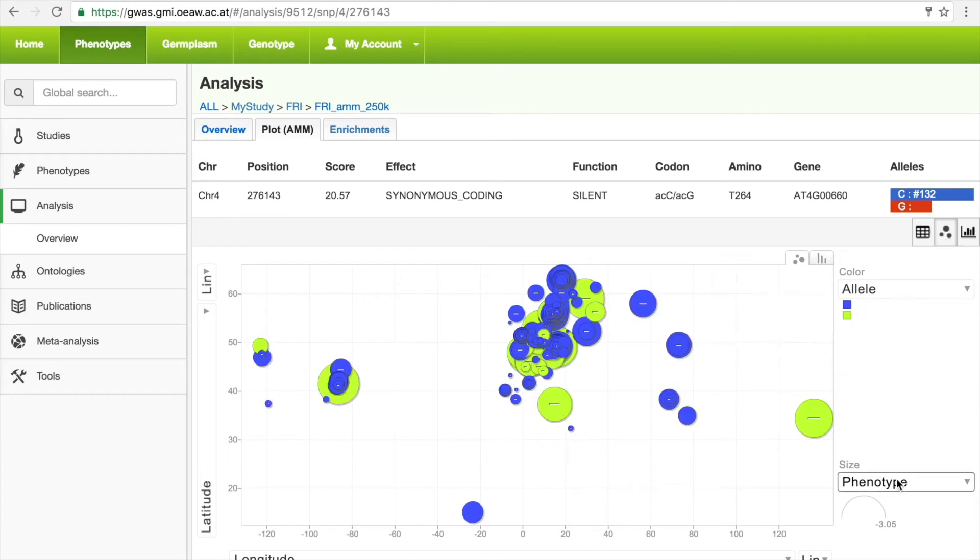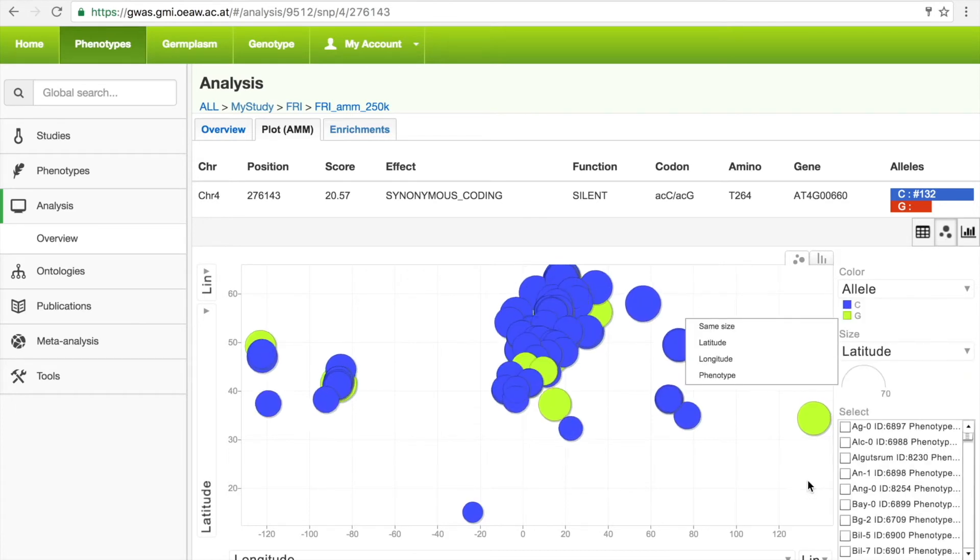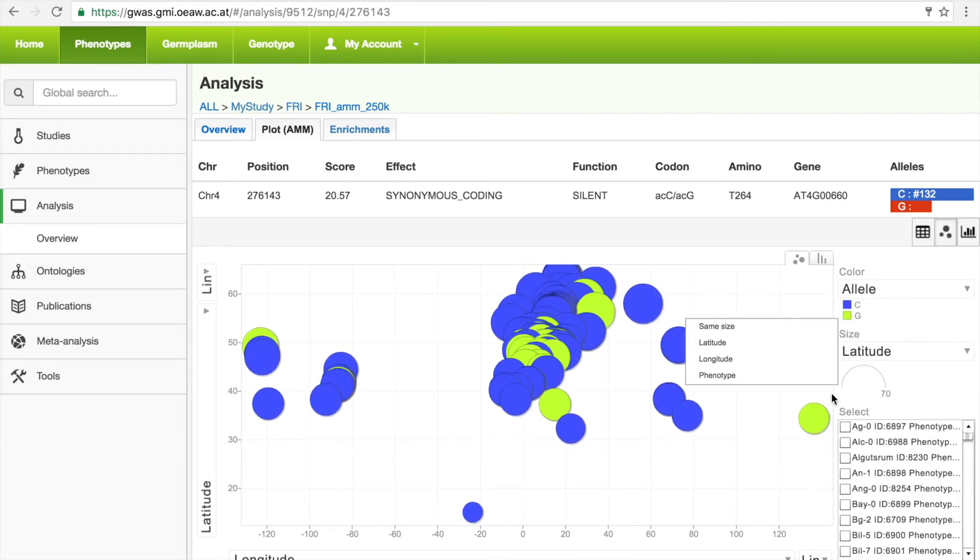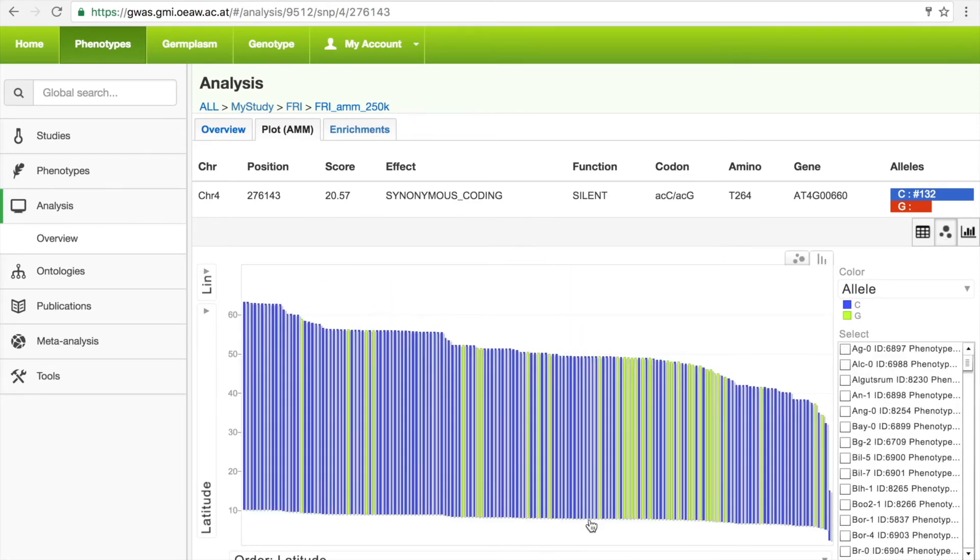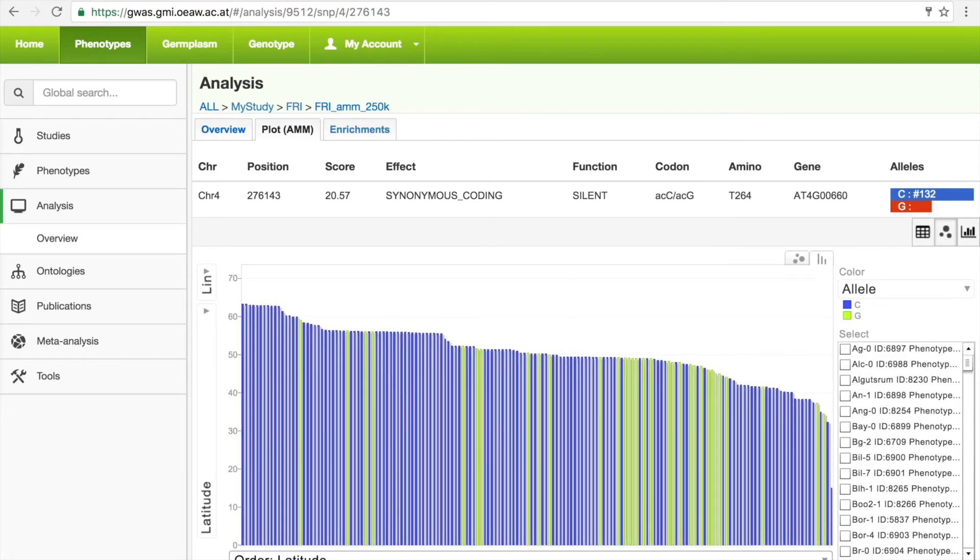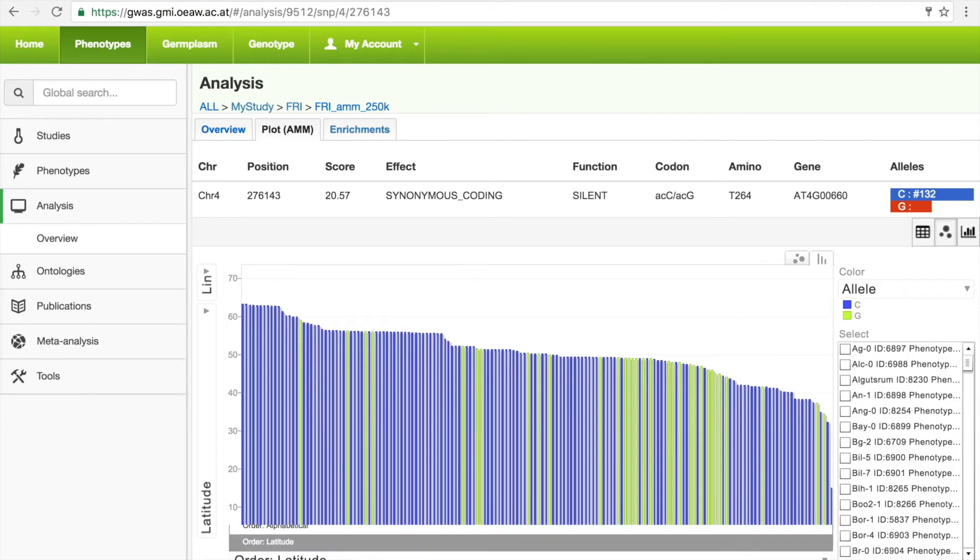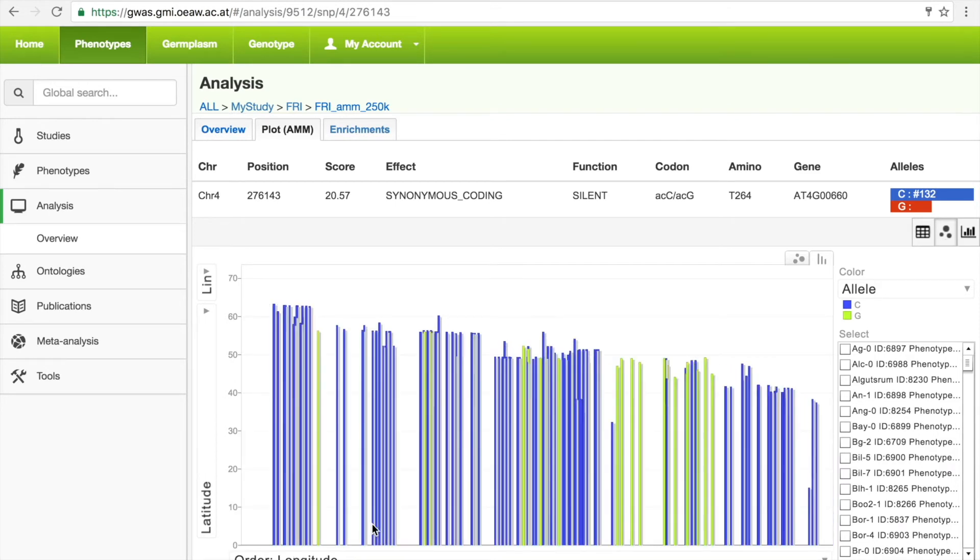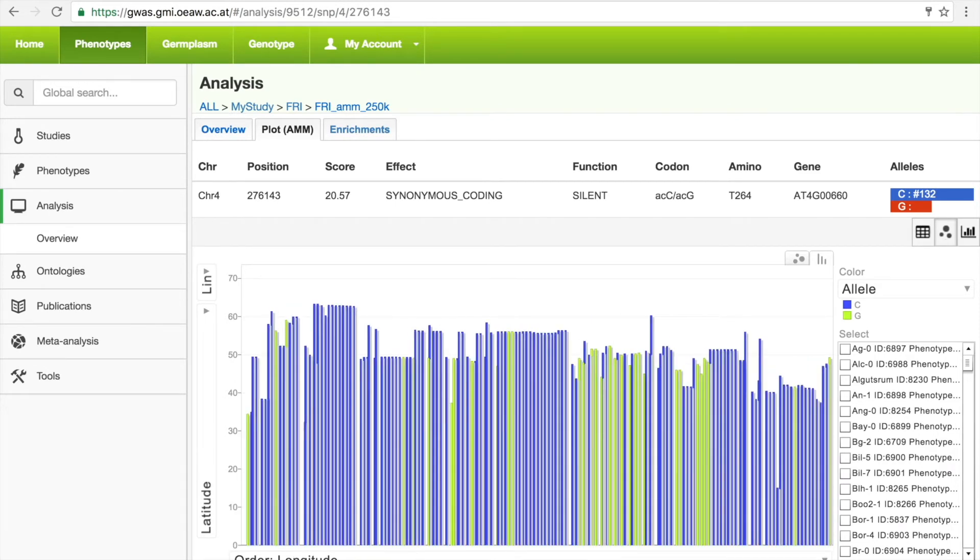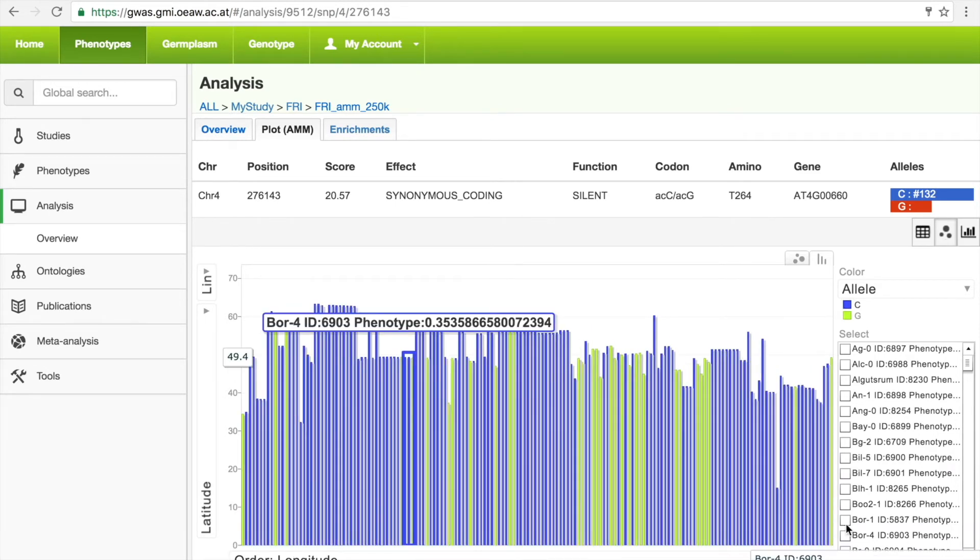The size of the circles can be changed based on their phenotype or on their location, and we can switch to a bar chart and change the axis to latitude or longitude to determine whether there is a specific geographic distribution to the alleles.